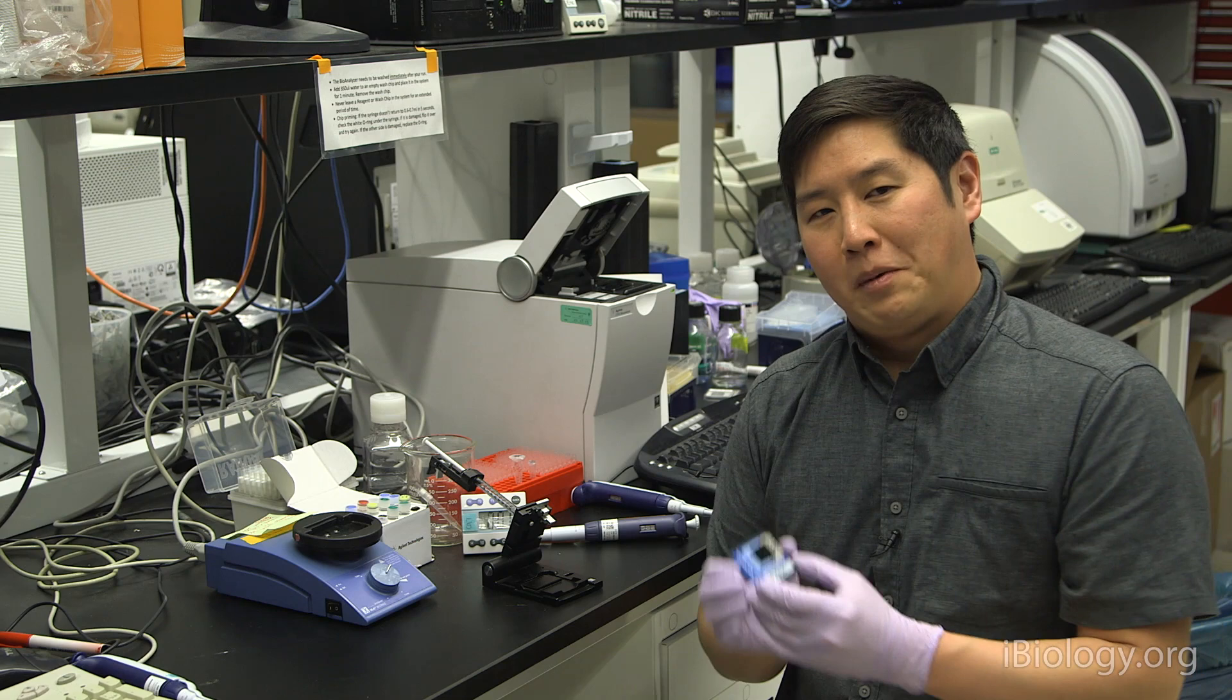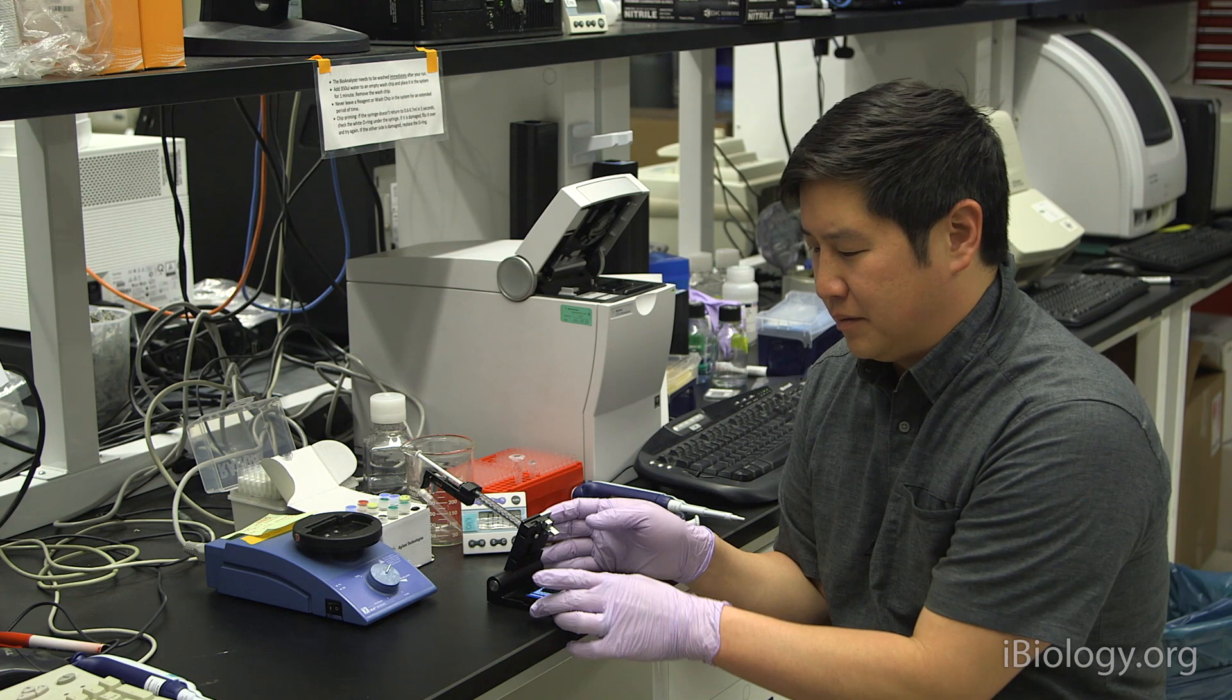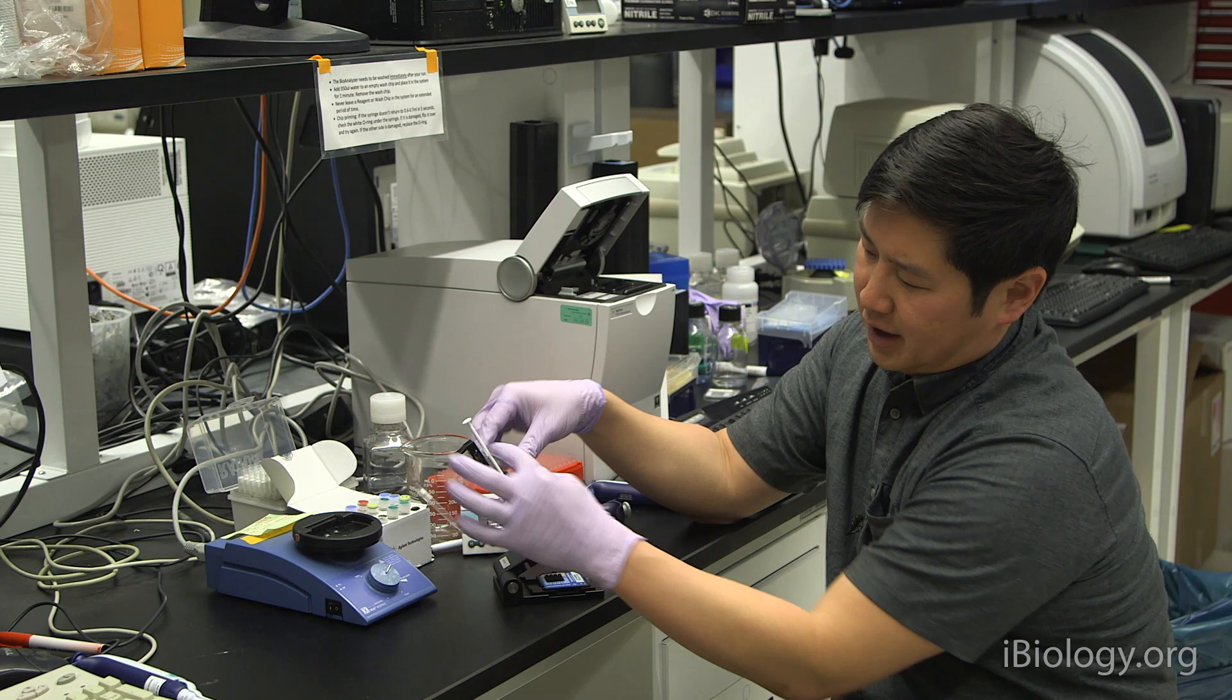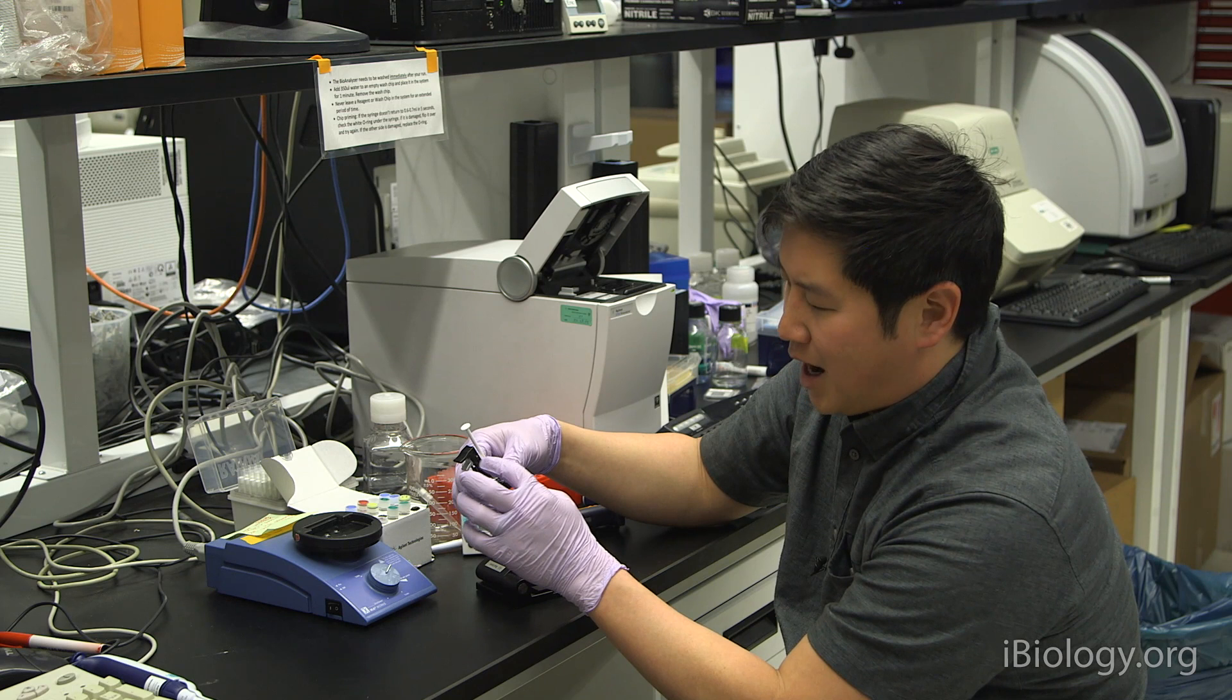Now, we'll prepare our chip. I've already opened this up from the plastic packaging, and we'll place this into the priming station. The chip sits down in here and doesn't really move. On the priming station, it's important to note that this is made of a plunger, and there is a holder to hold the plunger at different positions. Depending on which chip and assay you use, you'll need to make sure that you set the plunger to the proper setting.